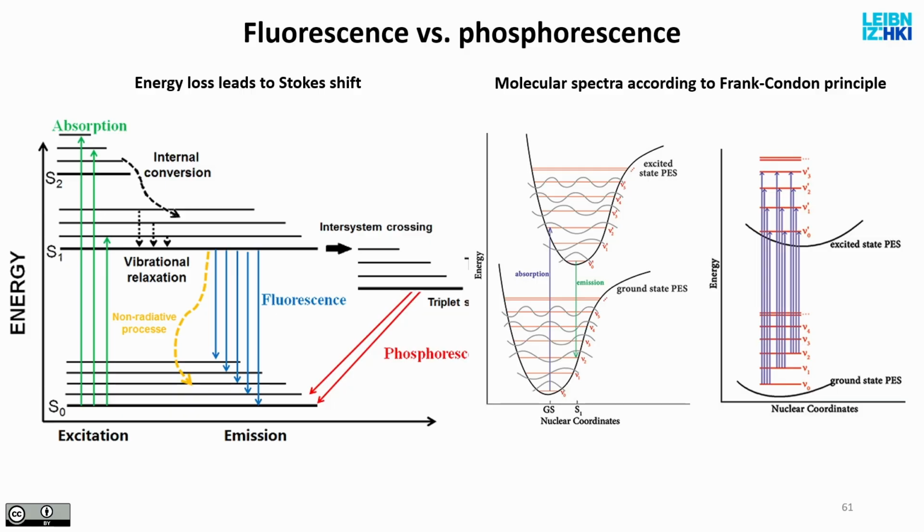Blue photons carry more energy, of course, that's why you get sunburned. Red photons carry less energy. So depending on the color of the light that you use, you may or may not have photons that are going to be absorbed by a certain molecule. Now, this means that this energy absorption event depends on the illumination and on the molecule itself. So you have to design both of them. And you have to know the characteristics of both of them if you want to design your microscopic experiment.